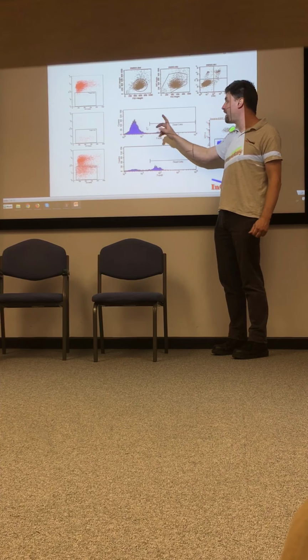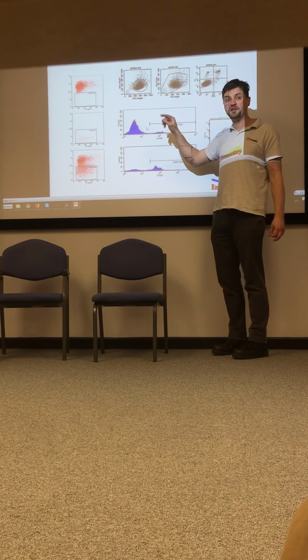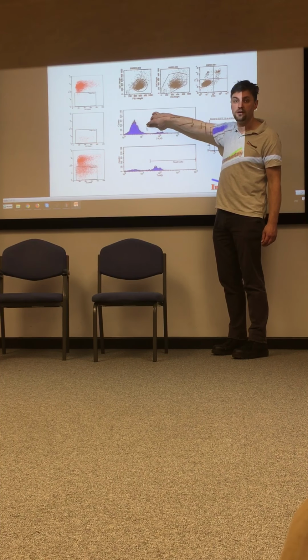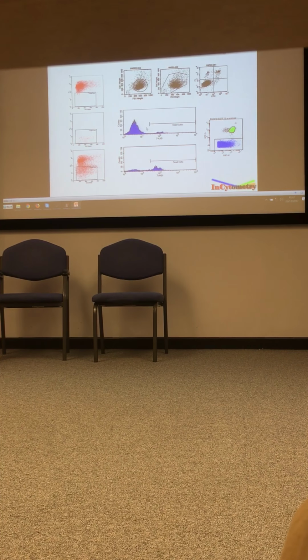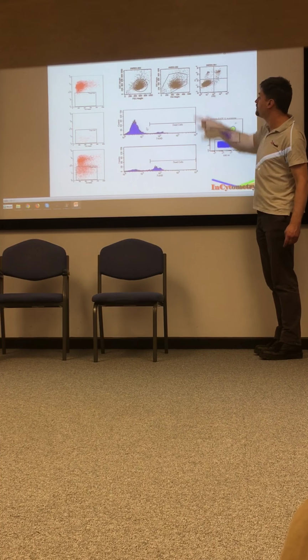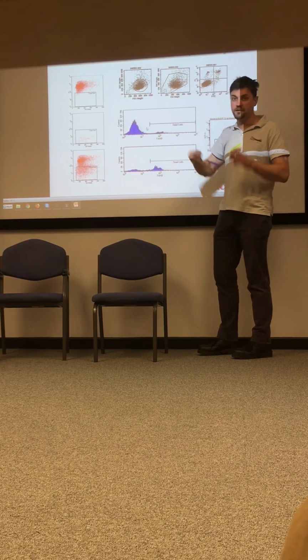Well, one I ran, and I couldn't find the actual file to make the slide, had been treated with detergent, and the dead cells were all within that marker region. So I put the marker region there because it just about enclosed the whole dead population, but it didn't include any live ones. This quadrant is quite easy to place. You can see where that population ends. You can see pretty much where that one is. That one's straight.